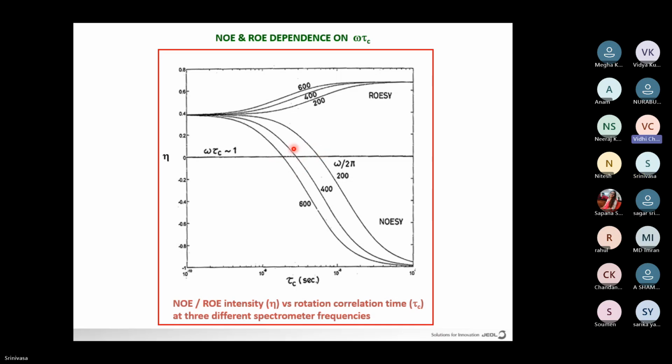Here I have a question. We are not getting good data for the NOESY experiment here, because some customer is asking about that. When they do NOESY on the Bruker, the data is very good, and when we do NOESY here, the data is not fruitful. That is one of the reasons. Bruker is a 400 or 500 megahertz NMR? 400. So when you compare our data with the Bruker 400, yes, there is something that happens.